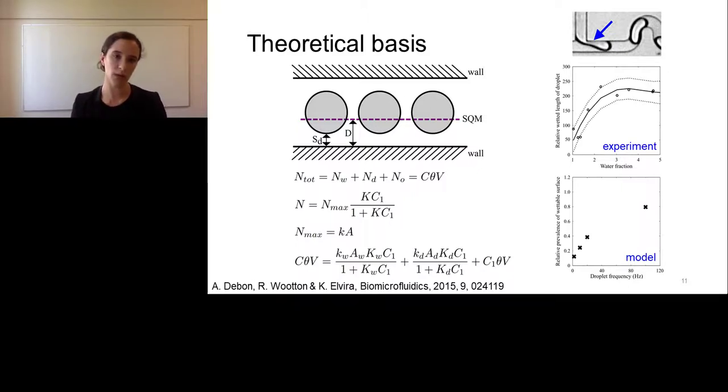And so the first line of that map basically looks at surfactant adhesion to walls as concentration. So this basically means all the available sites for adhesion of that surfactant to the wall surfaces or to the surface of your droplet, to just look at as concentration. This is basic Langmuir kinetics that you can look up afterwards if you want. And we did some simple maths to figure out if we could look at the probability of that surfactant adhering to those different surfaces, but also what would cause that adherence to fail.